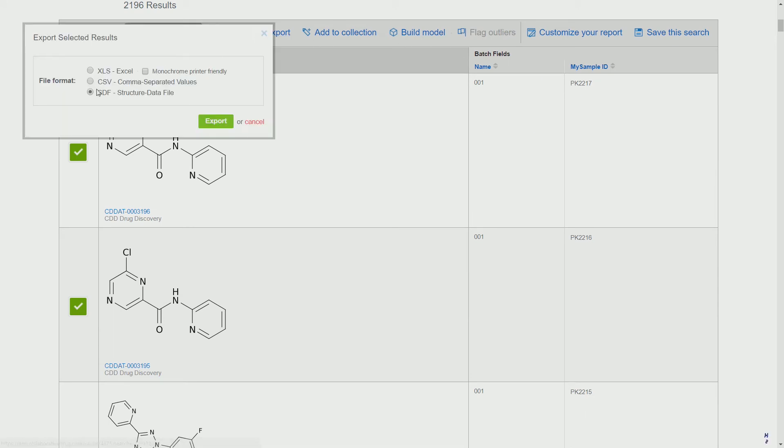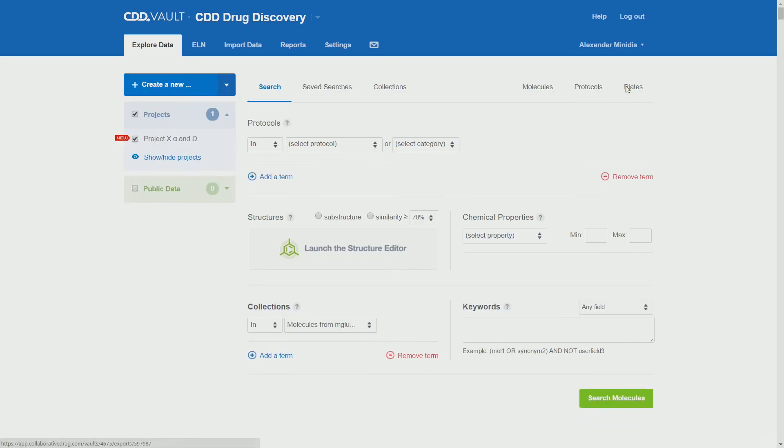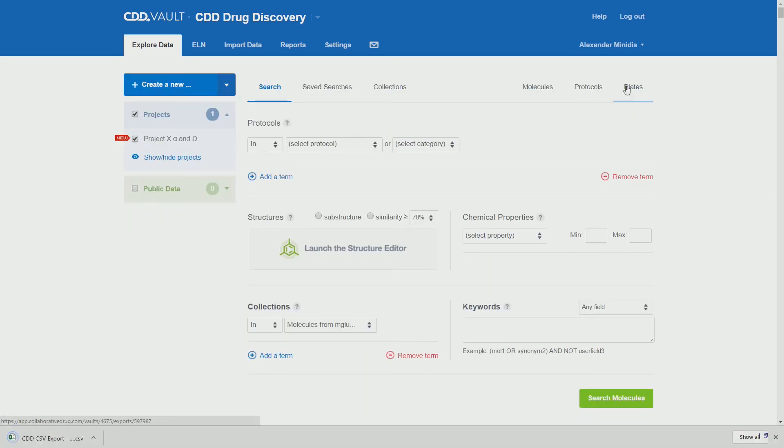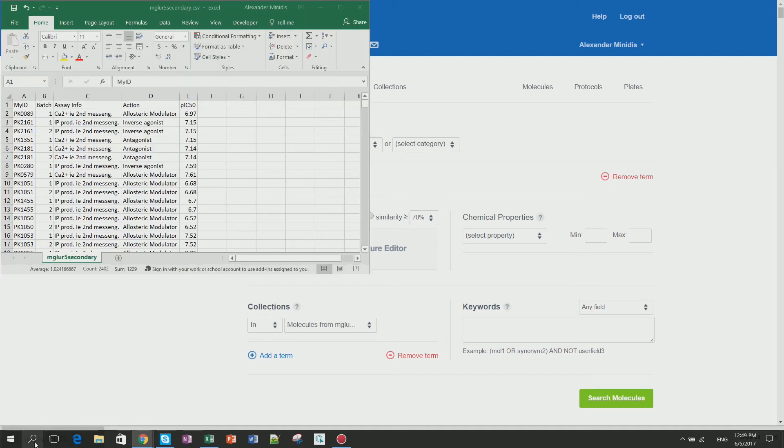And export as a CSV all the IDs. Once the export is complete, we can work with, for example, Excel to combine the vault ID batches versus our original sample IDs.